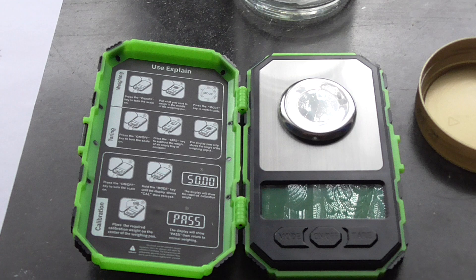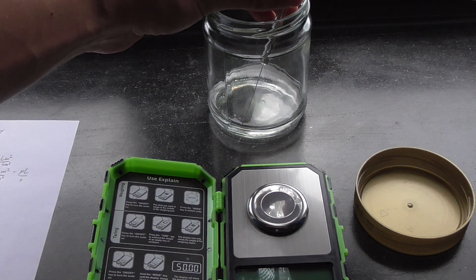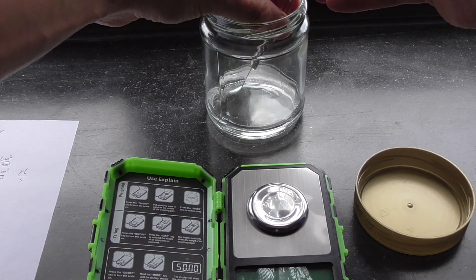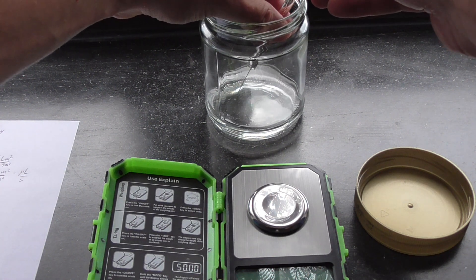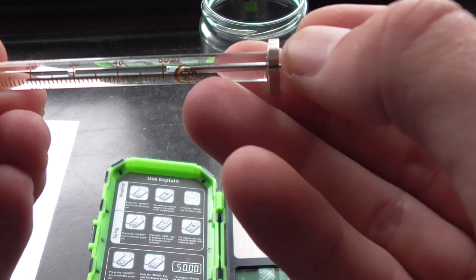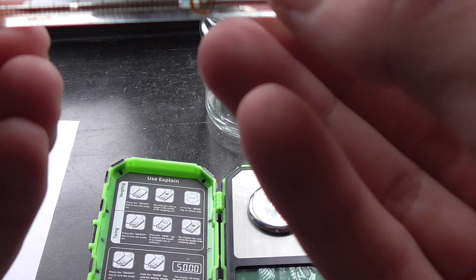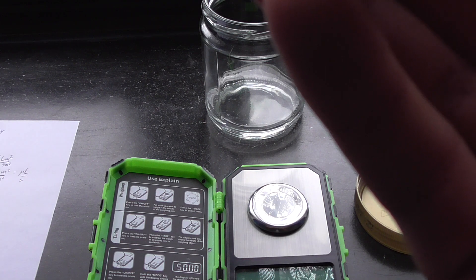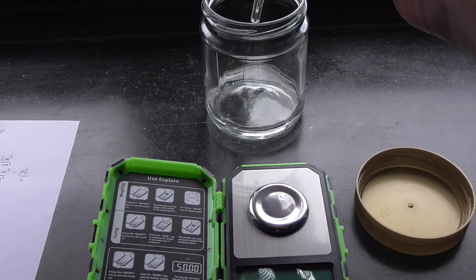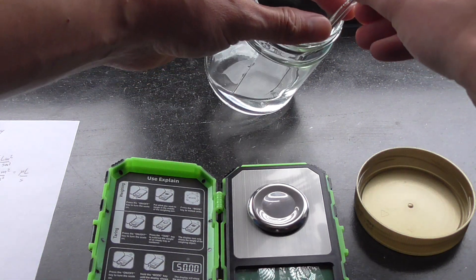I'll take this water out of the glass with the syringe and put exactly 50 microliters inside — this seems to be correct. I hope there are no bubbles. Well, there are some bubbles; I have to put it back and try again. I probably sucked some air inside, so let's try again.